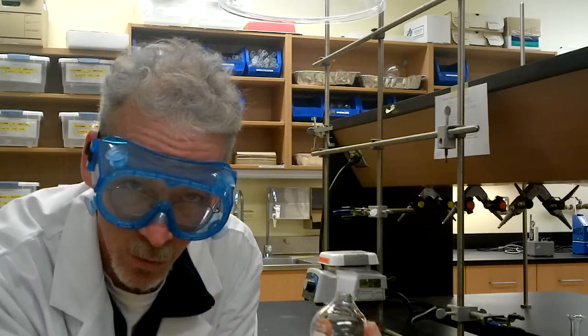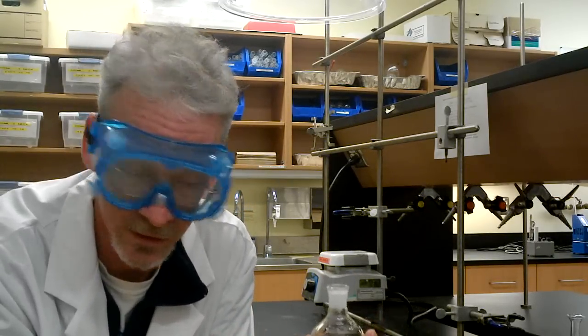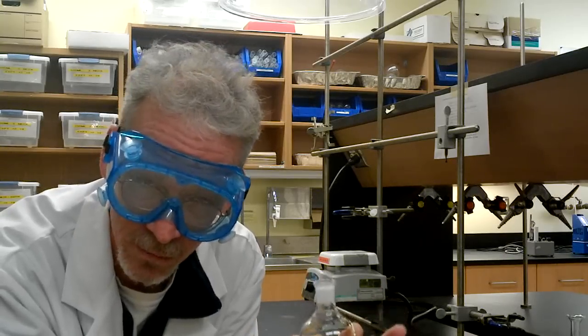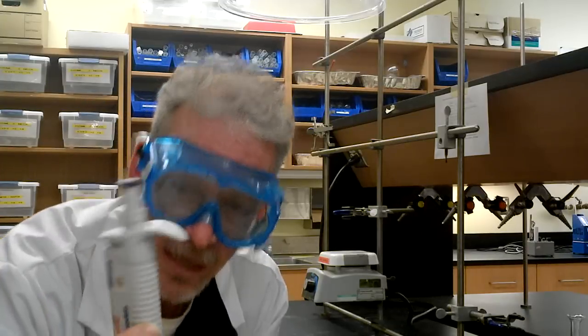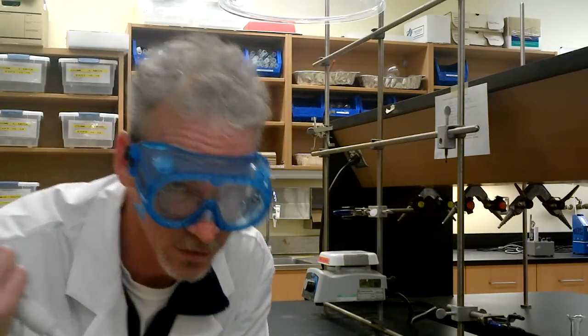We're going to put methylbenzoate in here first, and actually the best way to do that is take this to the fume hood, and we're going to use the Eppendorf and put our methylbenzoate in the flask. I'll go do that now.